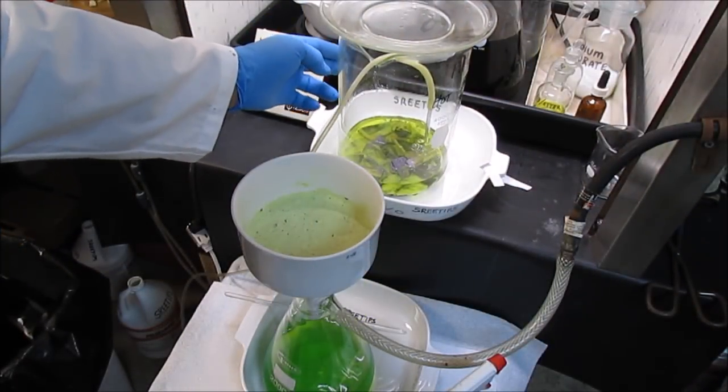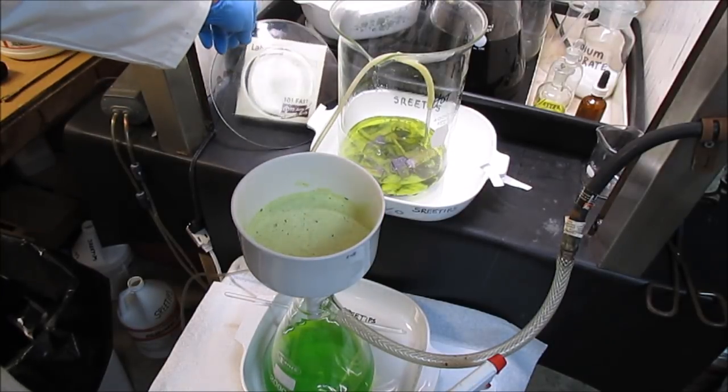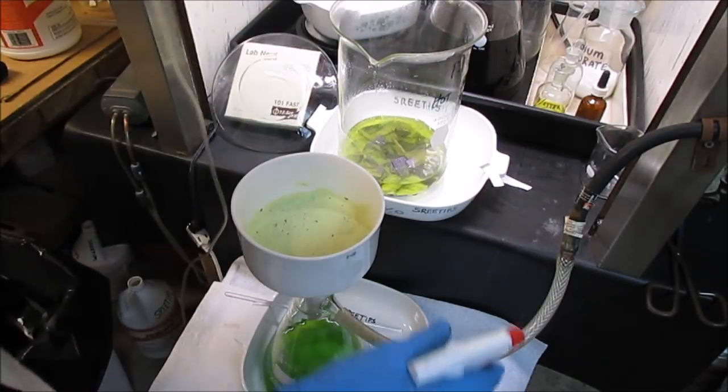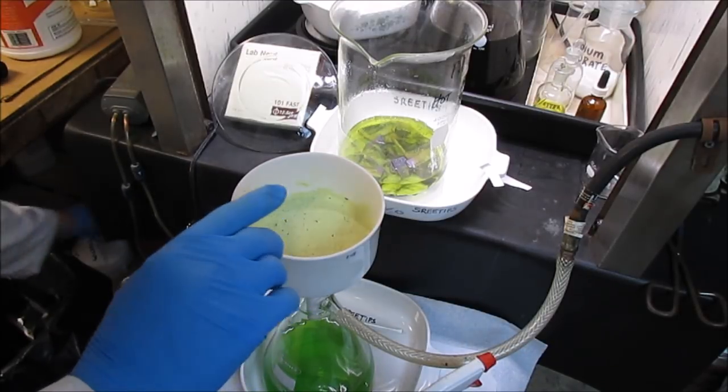The solution's been on the bubbler now for about a half hour. I think I've got just about all I'm going to be able to get out of this. I don't know yet. We'll have to see. But what I'm going to do is go ahead and pour it into this funnel here and add it to the rest of my solution.